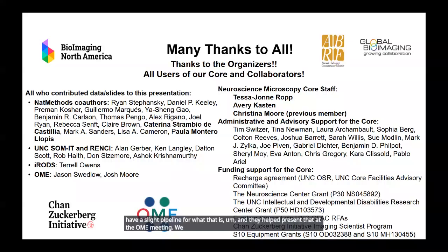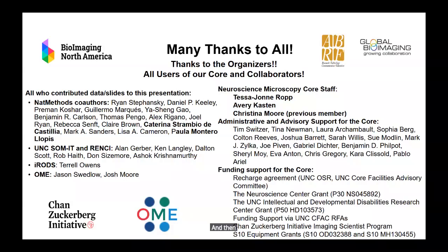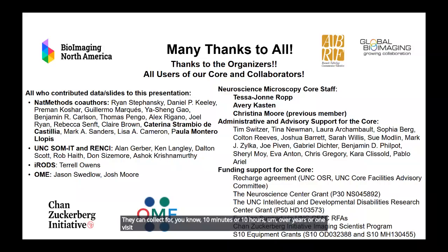We train individuals to use the microscopes, and then they are the ones bringing in whatever samples they choose to bring in. They can collect for 10 minutes or 10 hours over years or one visit. And then they are supposed to take the data off of our acquisition computers by the time they leave. It's not exactly true for some of the bigger data sets, but in theory we don't store any of their data. So they have to have a short-term image transfer.